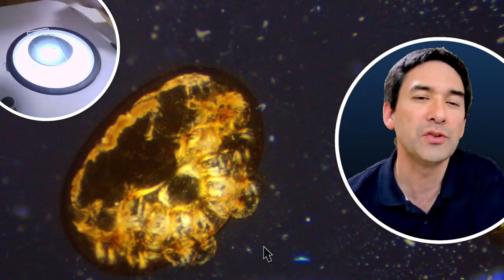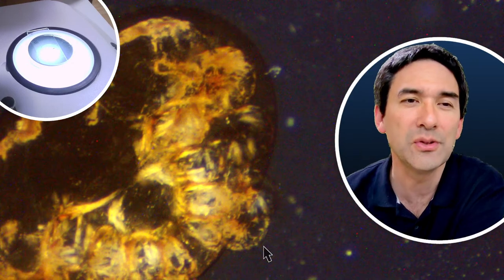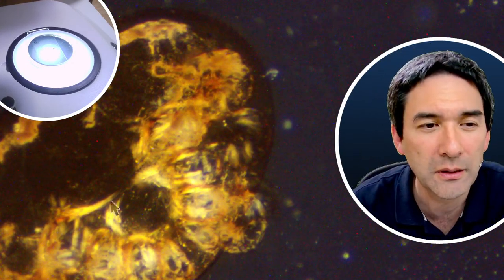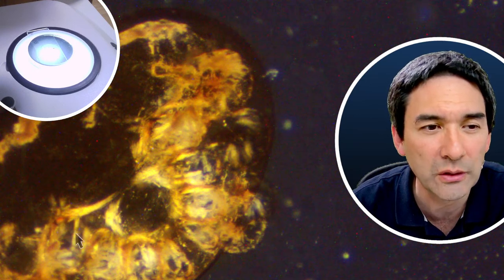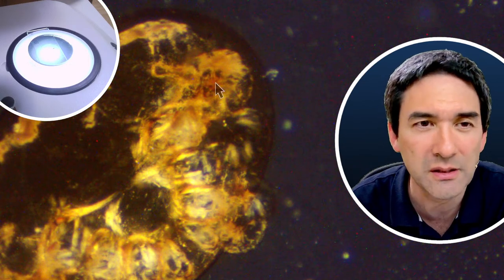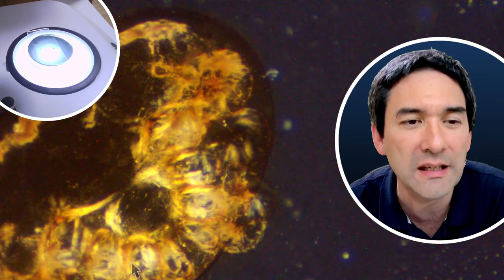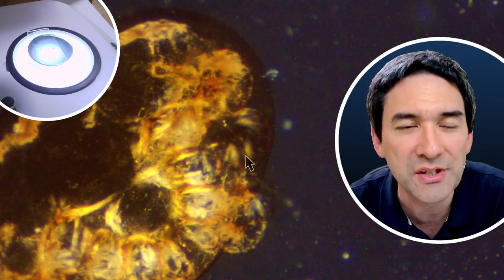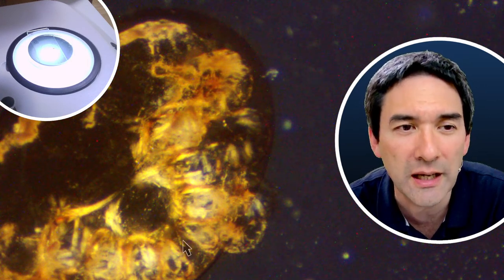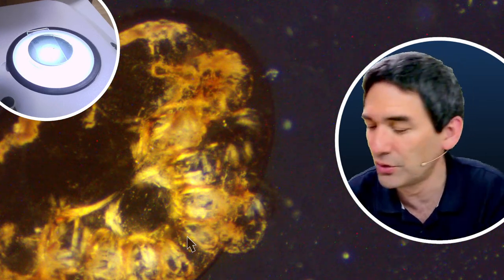Okay, but also here, I was positively surprised that I was able to see, not quite as well as in the dog flea, but also here those horizontal structures, where I assumed that maybe these could be some muscles as well, but I don't know. It's not quite as clear as with the dog flea, but in any case here as well, it's possible to see that some parts of the specimen seem to interact with the polarized light. So this is something I just wanted to show you.